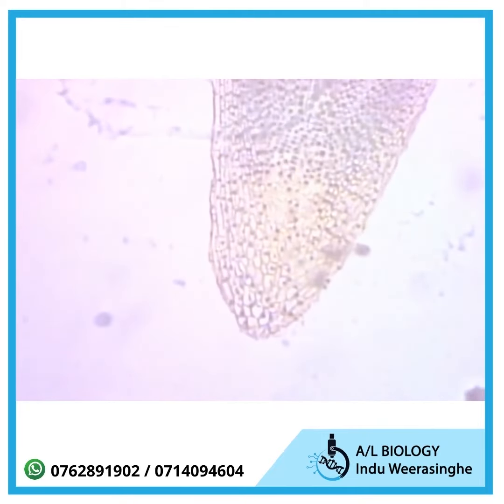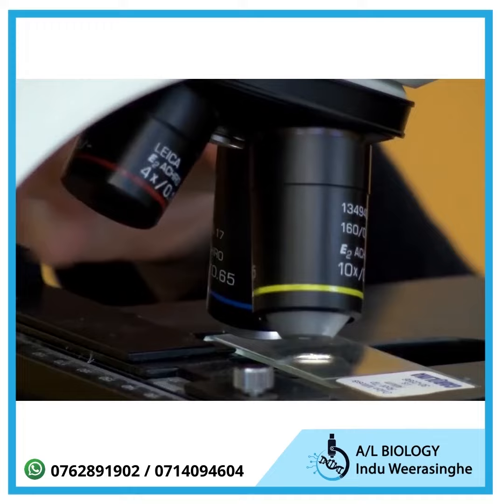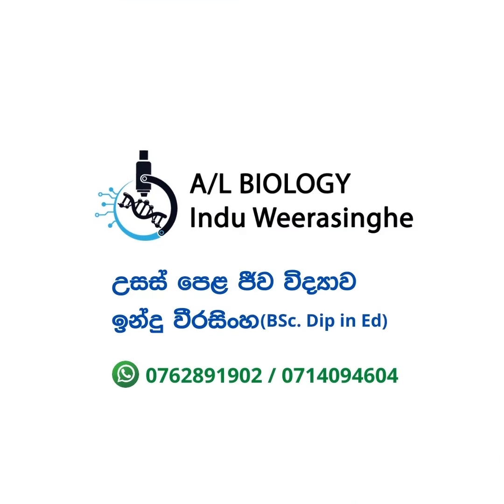Again center the specimen and you are ready to move to the highest power lens, 40X.